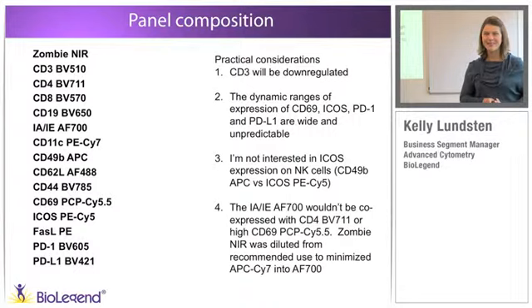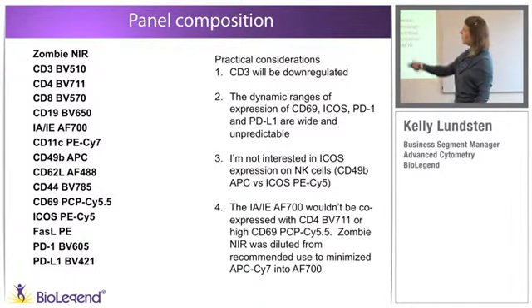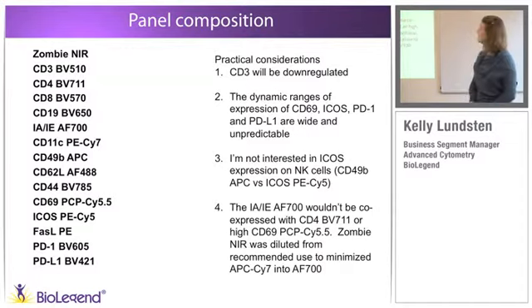So there's lots of papers on spreading error and cleaning up the compensation algorithm that we can point you towards if you're interested. So after all of that, this is the panel that I came up with on the left-hand side here.